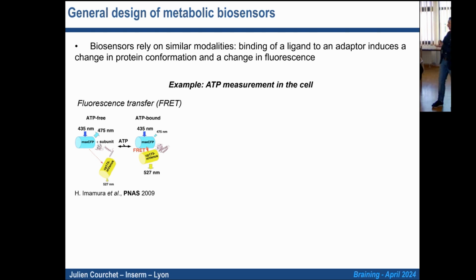So I don't know if you are all familiar with FRET. The idea is that any fluorescent molecule has one excitation peak. You will put some light into it, and by the energy that is provided by the light, it will turn your fluorescent molecule into an excited state. And the release of this excited state return to normal will emit a photon that is the fluorescence that you are actually looking at. All right. Just let me know if that is not clear.